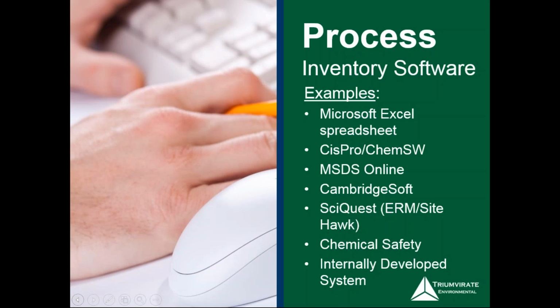Now, the other part of the process is, what type of inventory software are you going to use? This is probably one of the areas that people have a lot of questions on, and there's a high focus on, but there's a reason why it's coming this late in the presentation. It's because we want to make sure you're asking yourself all the questions that we were talking about earlier, and figuring out why you're implementing a chemical inventory, and some of the logistics behind it, because that's really going to help you match yourself with the best chemical inventory out there.